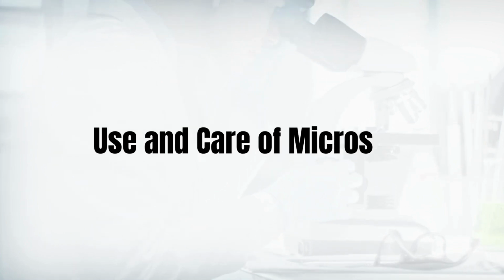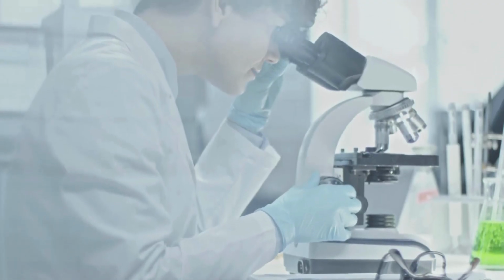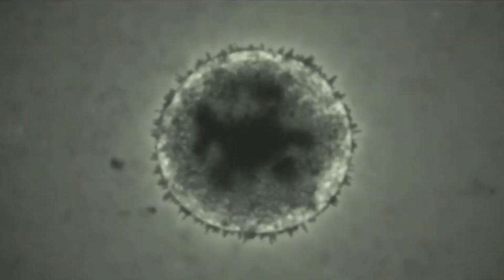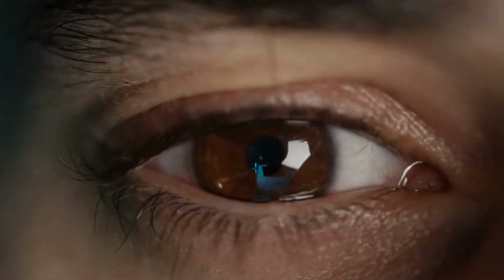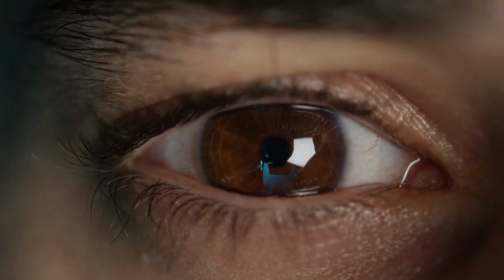Use and care of microscope. Microscope is an instrument which is widely and extensively used in the biology laboratory. It magnifies and resolves the objects seen through it. Microscope increases the size of retinal image, the image formed on the retina of eye of an object.